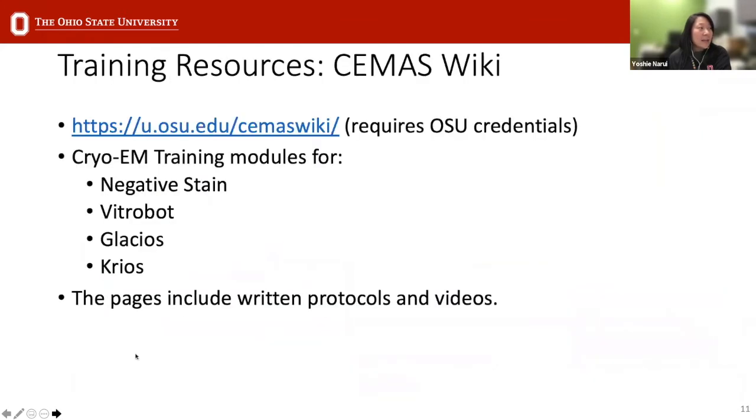I want to mention at this point that the biochemistry is more on the user end. We understand it takes a very long time to get a nice pure sample, express it, and get a good yield. So we want to make sure that we do everything we can to help you with that precious sample.